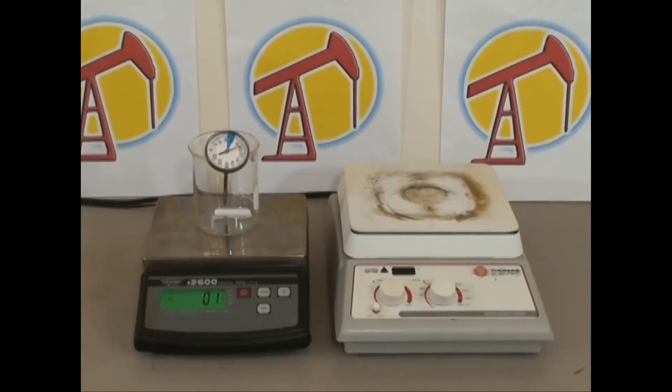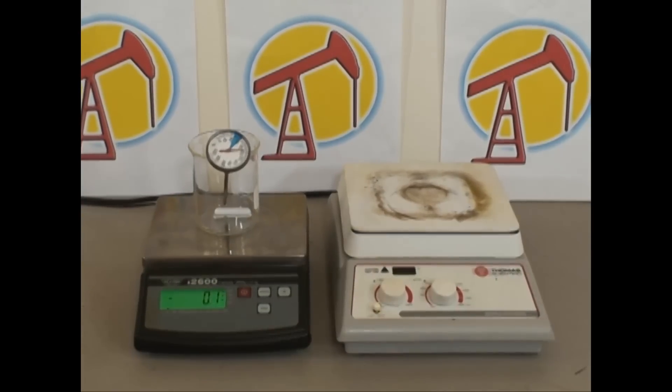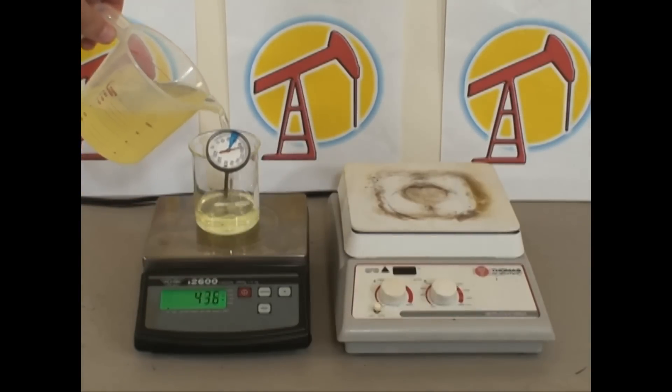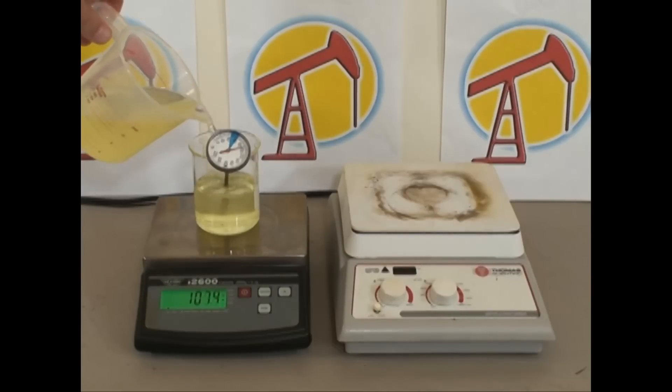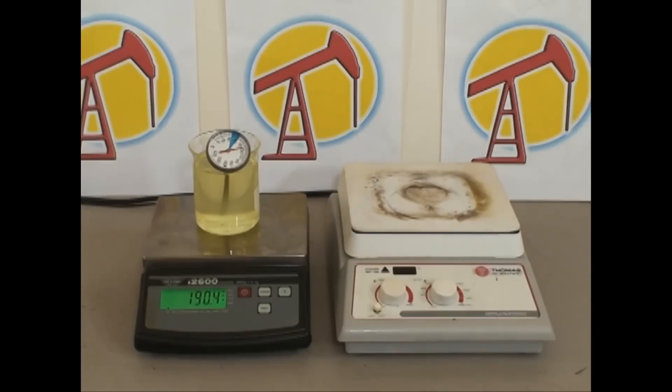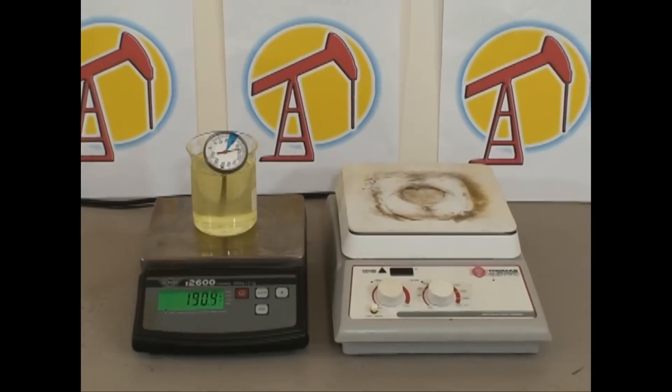With the scale zeroed we can now add the biodiesel — or we could be adding vegetable oil, it doesn't matter. This is biodiesel. We're going to add between 180 and 200 grams because that's what the beaker can safely hold. It looks like 190.4 grams.